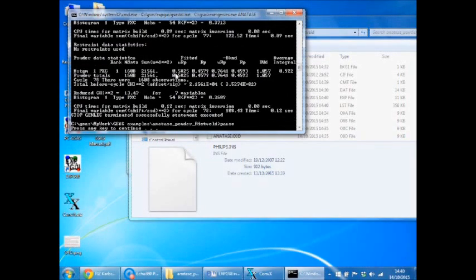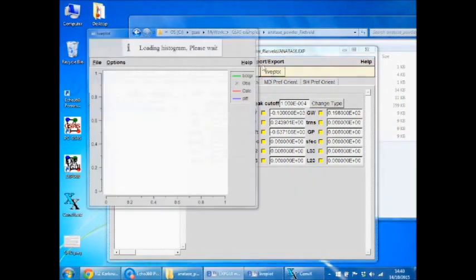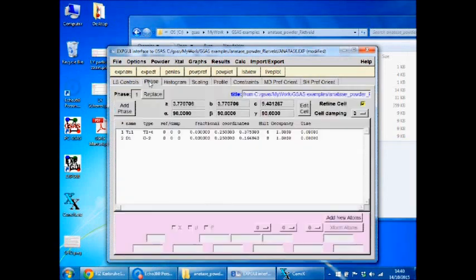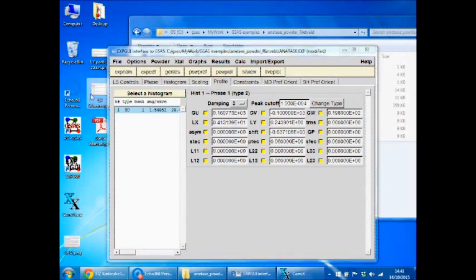And that's made things not better at all. I just have a feeling that it's not going to get any better. It's not bad, but it's not great either. But for this example, I hope you understand how we've got the lattice parameters now, and again from the profile we've got Lx, which can be related to the average crystallite size of your material using this equation here.